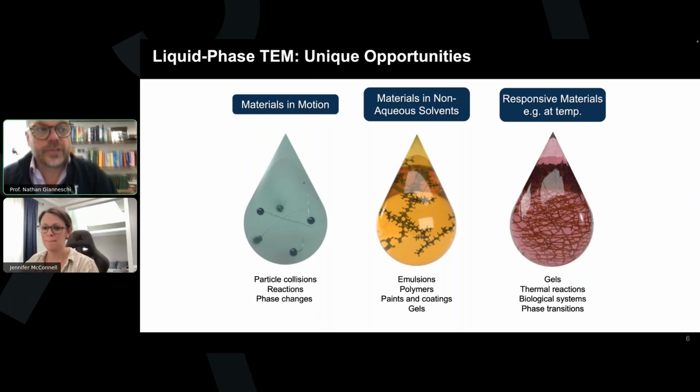So if you're interested in those types of systems, right? So dynamics, emulsions being sort of mixed phase, things that are non-aqueous, and things that have either dynamics or structure that are temperature or solvent dependent. Those are good candidates.